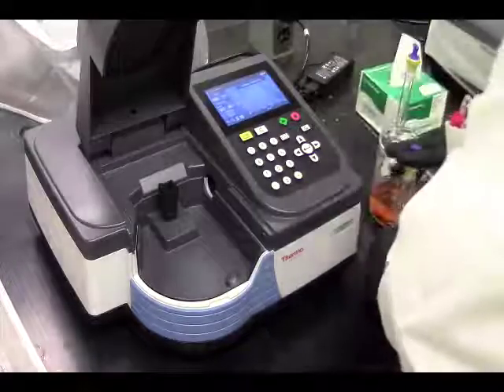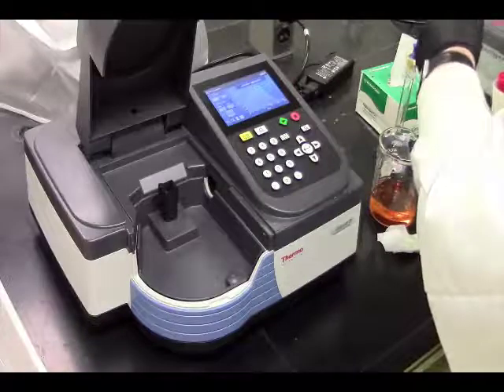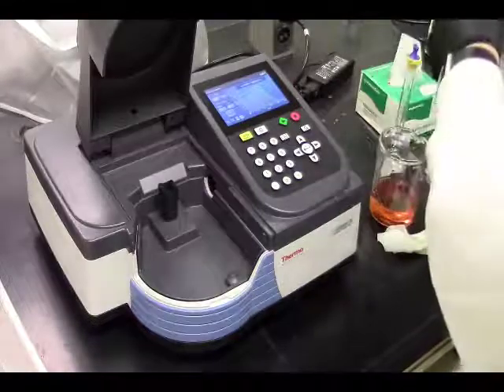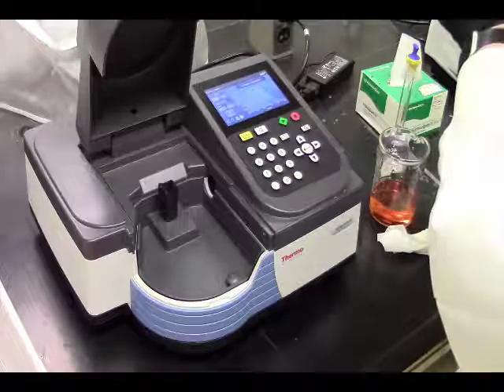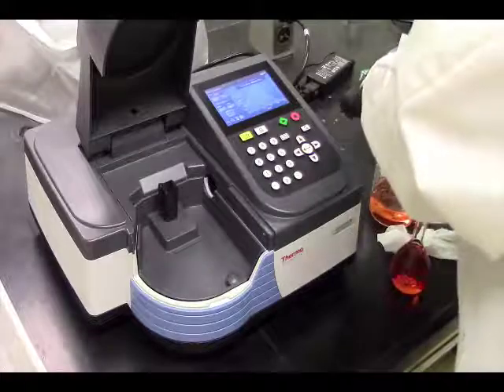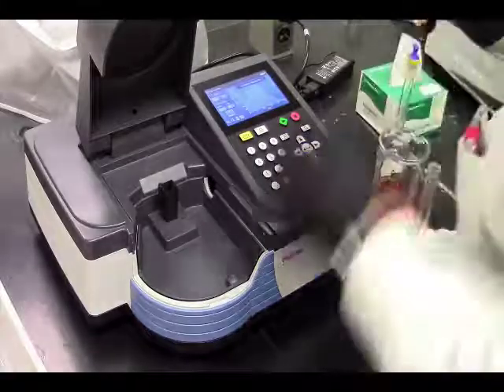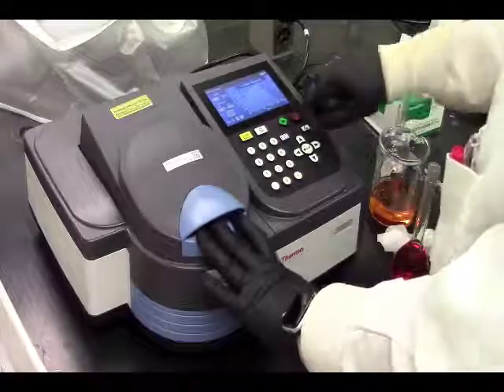What are the units on that? OD. Remember, there are really no units for UV-Vis. They are OD units, which is arbitrary units made for the intensity. But Beer's law states you have to maintain an absorbance of less than what? Which you should have in your report.